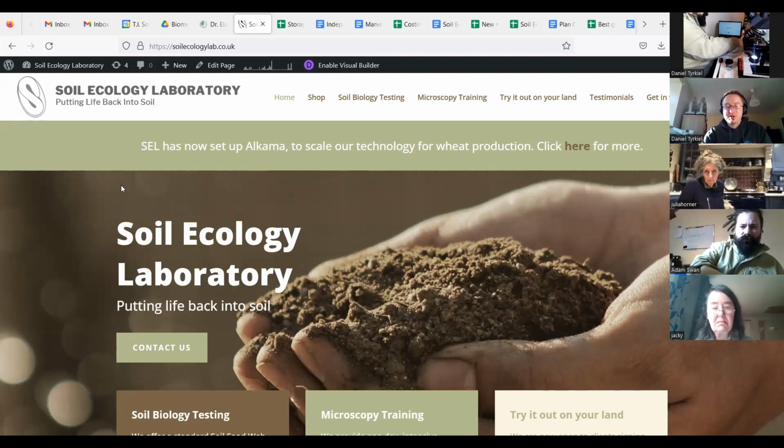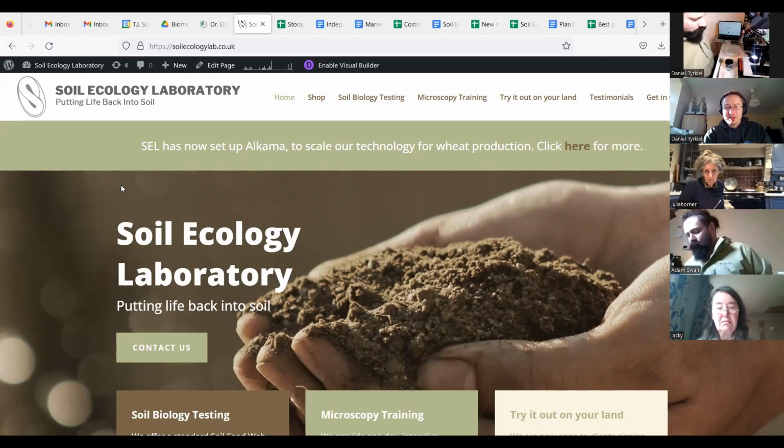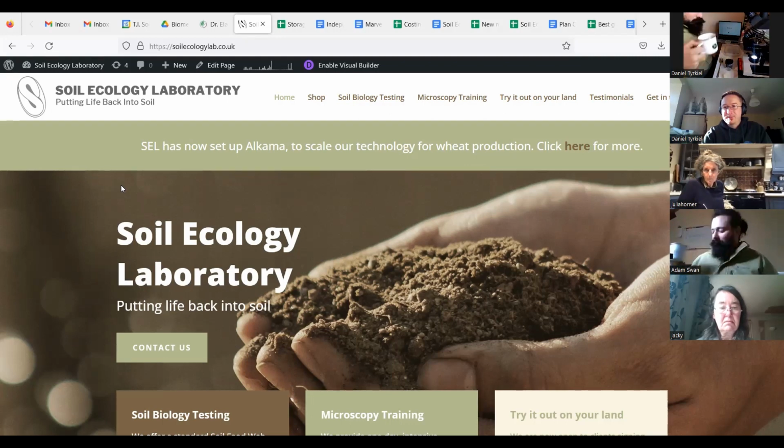I think this is part of her PhD work, actually, where she basically put together the ability to look at all organisms in the soil using the microscope on one slide, whilst especially at the time, the only real methods were colony counts, growing things out on plates, separating things from each other. And so direct microscopy was a way to do a quick assessment.